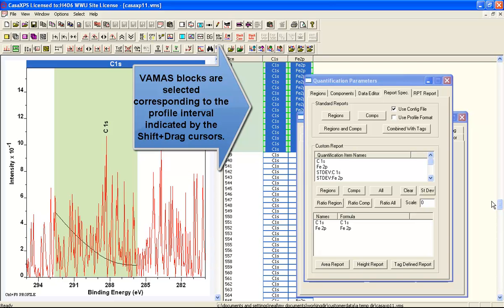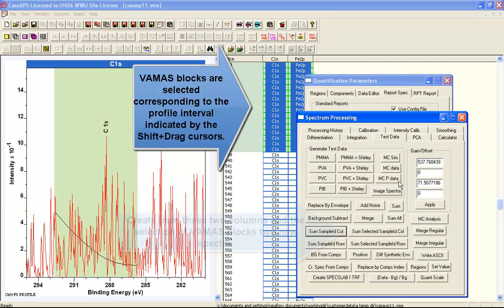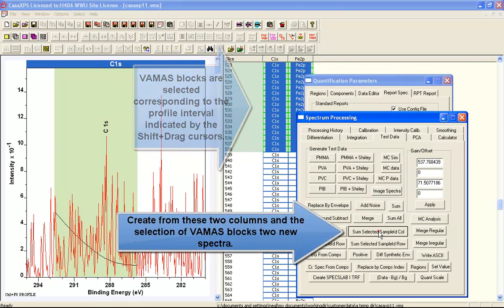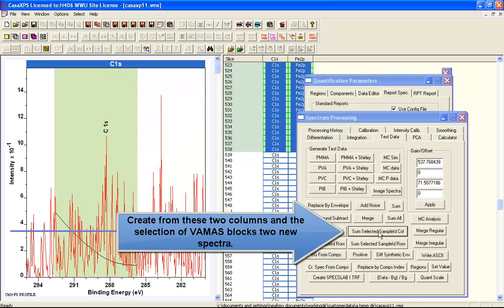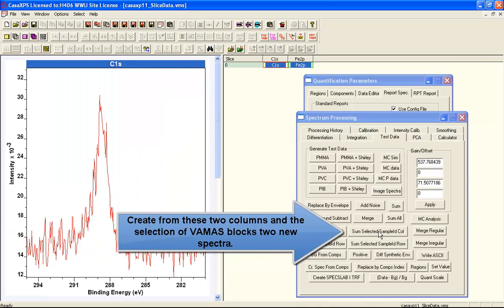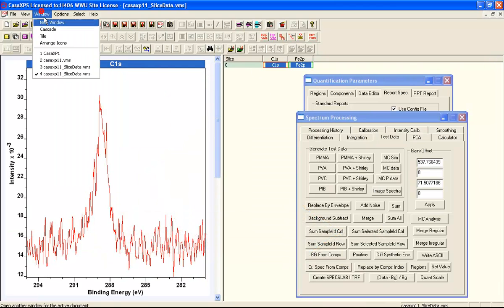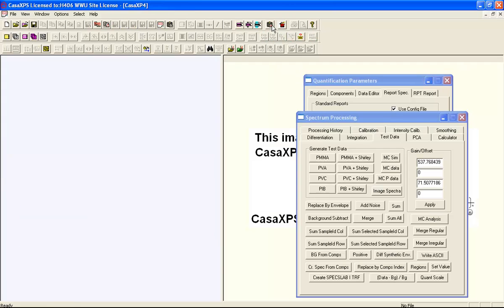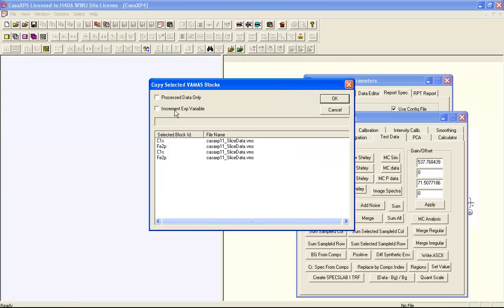that cursor selection has selected a range of VAMAS blocks. When I say sum selected VAMAS blocks, I end up with a new pair of spectra based on a subset of the original set of VAMAS blocks.